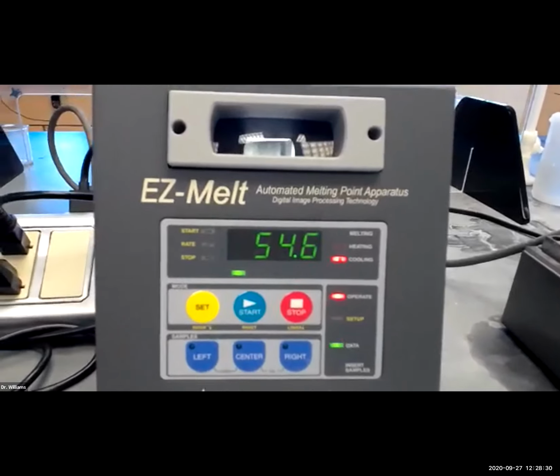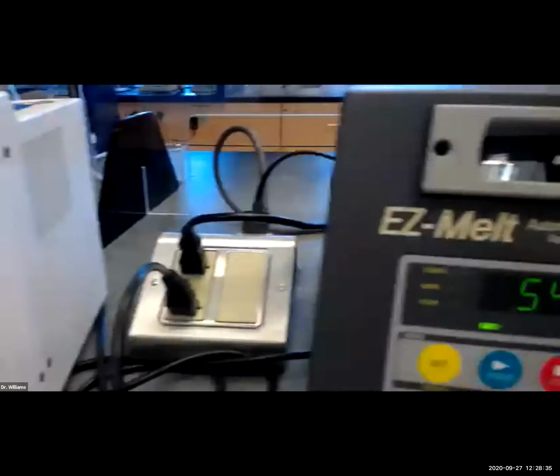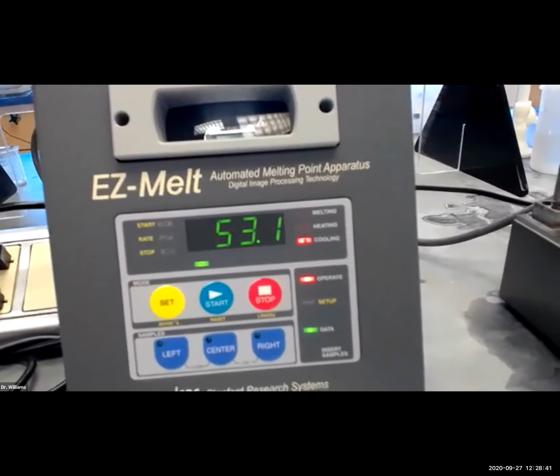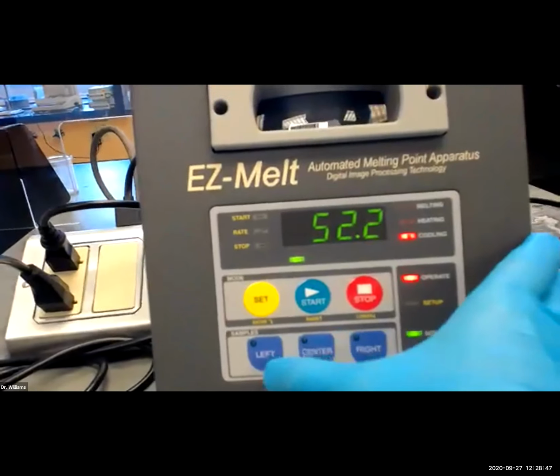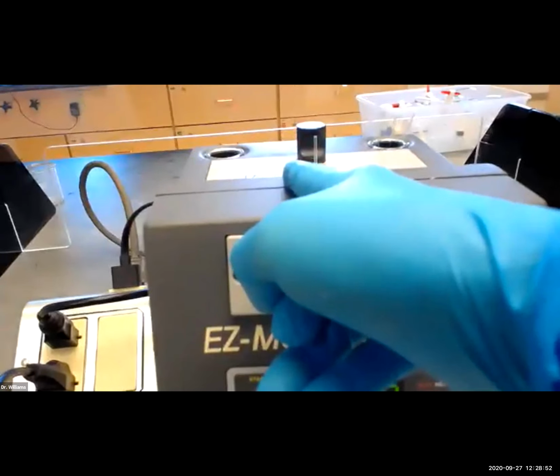The melting point determination is finished. And you'll hear the fans going on. So it's cooling back down to the start temperature, the start heating temperature. Notice that the data is flashing. That means we have data in there. So I'm going to go over here and press where's the sample? It's in the left.